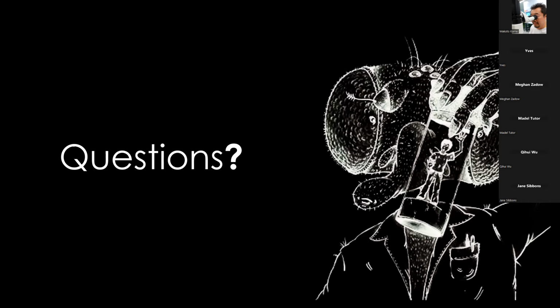Okay. Yeah, I forgot to mention this. You should definitely start with the simplest expansion technique, where you stain your sample before expansion, the first one that I discussed, because it's pretty straightforward, and also you can visualize the sample before and after to evaluate the expansion rate, to see that it's not distorted, and to compare it.